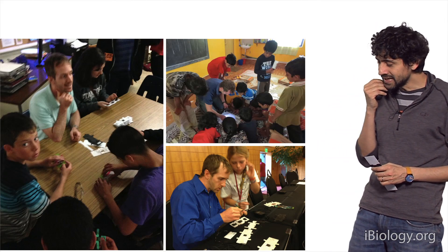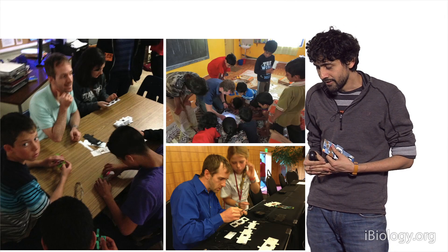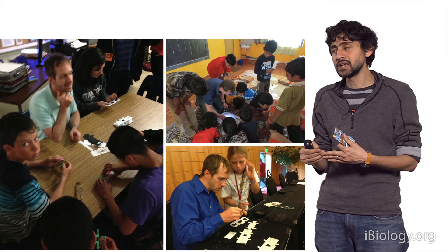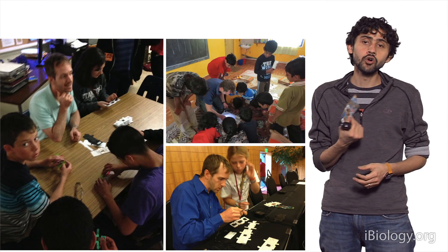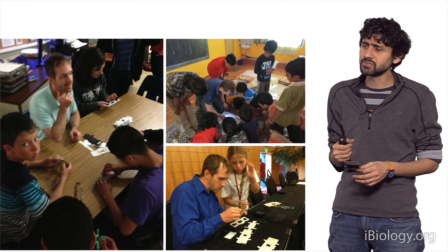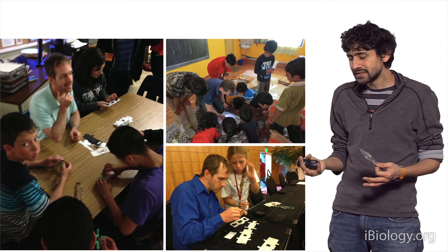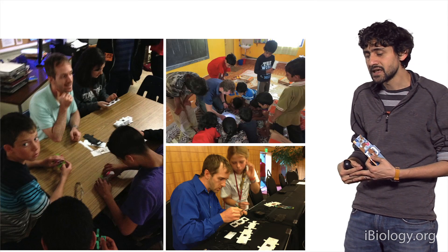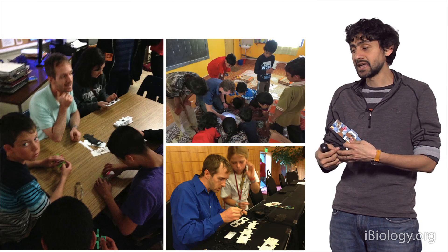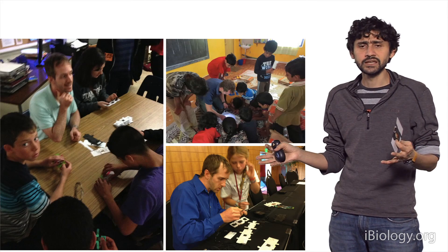I wanted to end with where we are going and what is our vision. One of the visions we have is of a world where every single kid could carry a microscope in their own pocket at all times — very much like people carrying ballpoint pens as a tool to write. We've been looking at this idea for the last couple of years, sharing and building workshops for how to build these instruments and explore the microcosmic world with everybody around you.